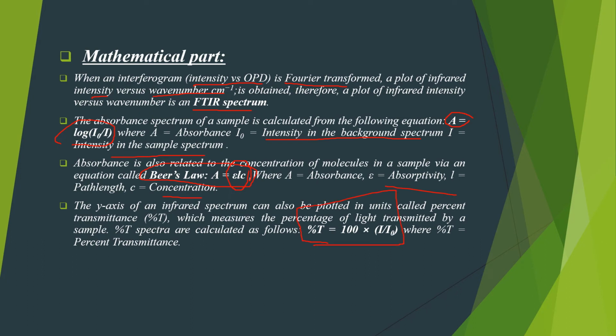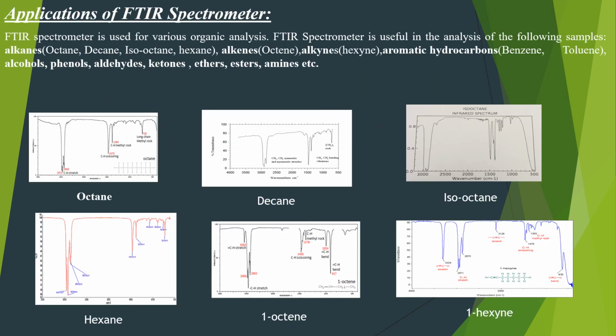Prior to the sample analysis, we take the background spectrum to minimize the carbon dioxide and water contamination peaks. So without the sample, we allow the radiation to pass through our experimental setup, and then we put the sample in and take the measurement. From that we get I, and from the background we get I0. We use this formula for finding absorbance and transmittance, and the computer plots the graph and we can easily say which sample is present.